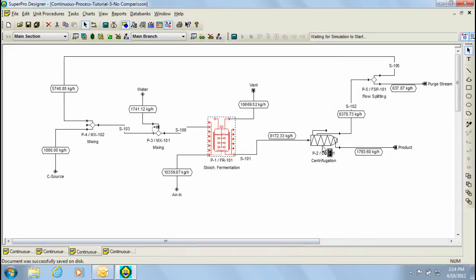Next, a centrifugal separator is used to remove biomass and a product and waste stream are generated. Also, notice that the waste stream has been recycled back to the feed in order to minimize product loss. Notice as well that a purge has been added to the model. The reasoning for this will be explained shortly in the video.